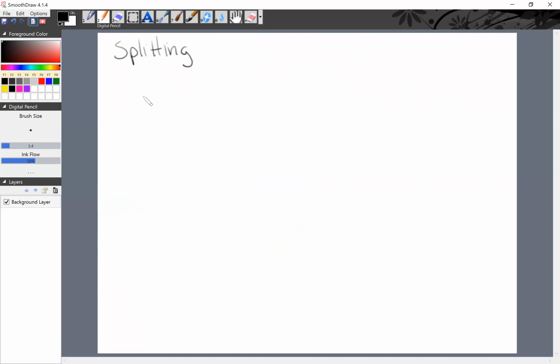A singlet is one line, and that is because there's no neighboring H. So it has no neighbors.